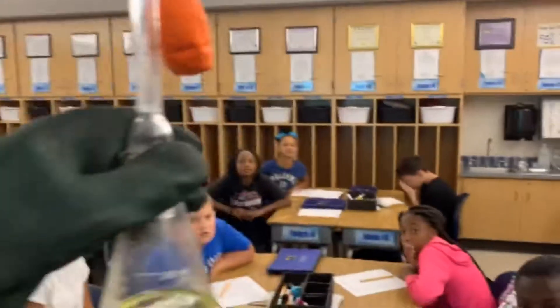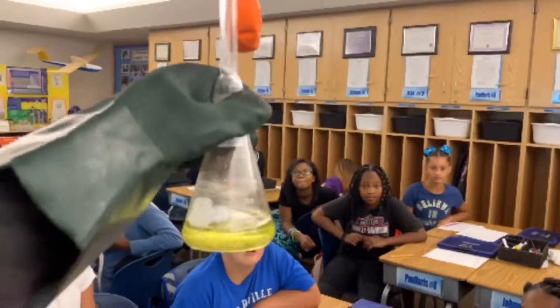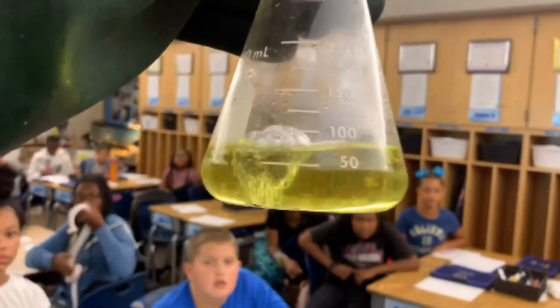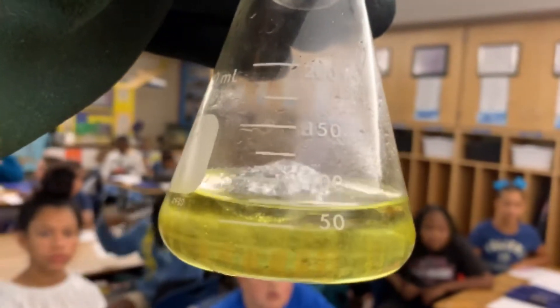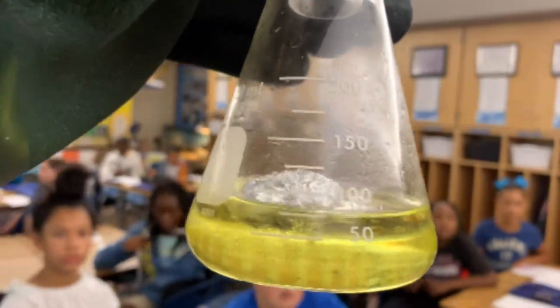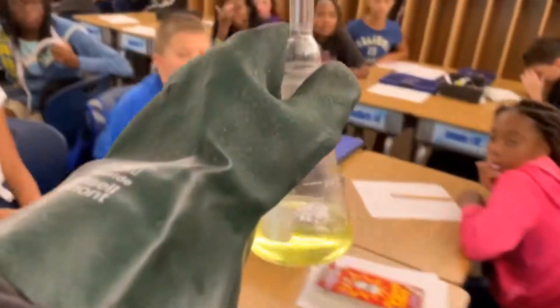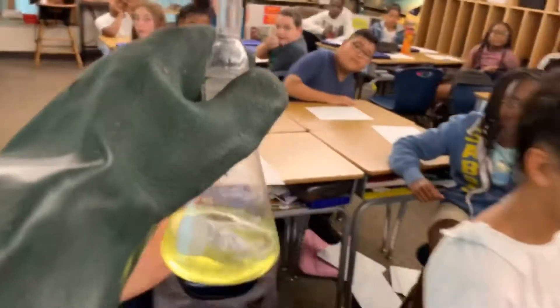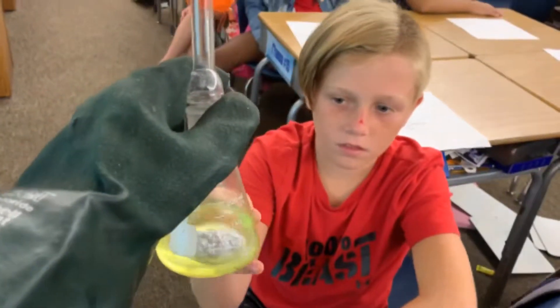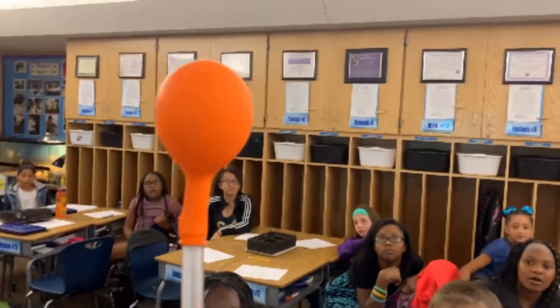We want to see if that gas will fill the balloon and if it creates heat. Right now the balloon is not inflated. I'm looking at that aluminum foil and it's going to start to cause a reaction. How does the flask feel right now — hot or cold? Cold. Nothing's happened yet — we would say it's not exothermic yet.